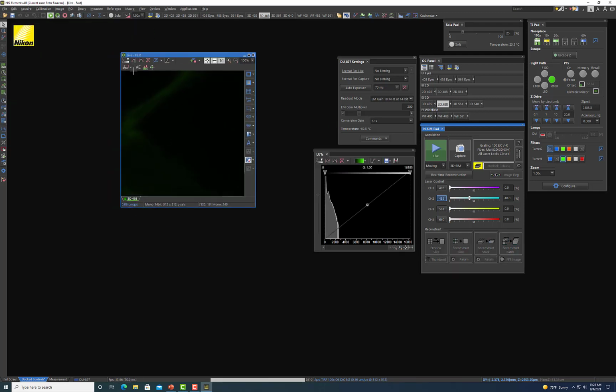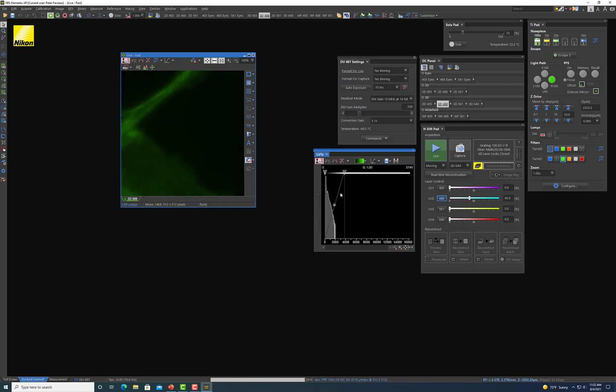And luckily there is something in here. What you see here is just our green fluorescence, but it's pretty dim. So I'm just going to kind of move this LUT window. And now what I'm going to do is just get this into focus a little bit. Great. So you might be saying, looking at this, what are these lines? And that looks pretty bad.